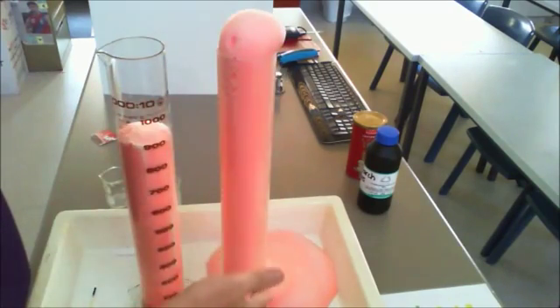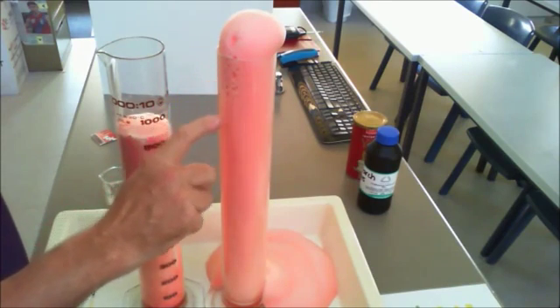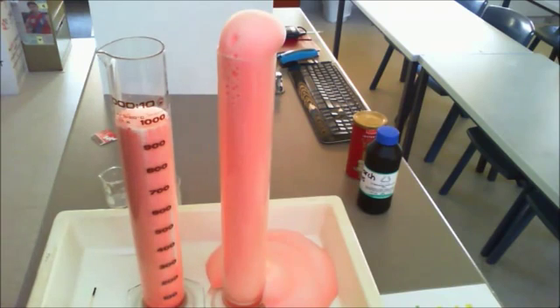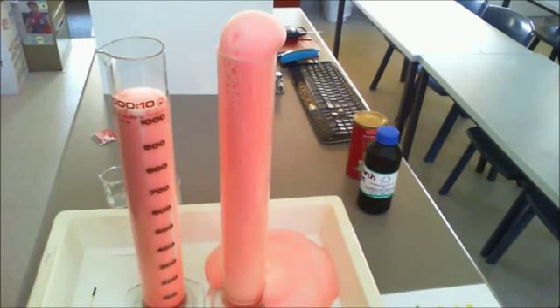You can see here that we have the oxygen present, and we can tell that there is gas occurring through that procedure. You'll notice that we've got far more occurring on the right hand side than we do on the left hand side. So this is the one that had more catalyst.